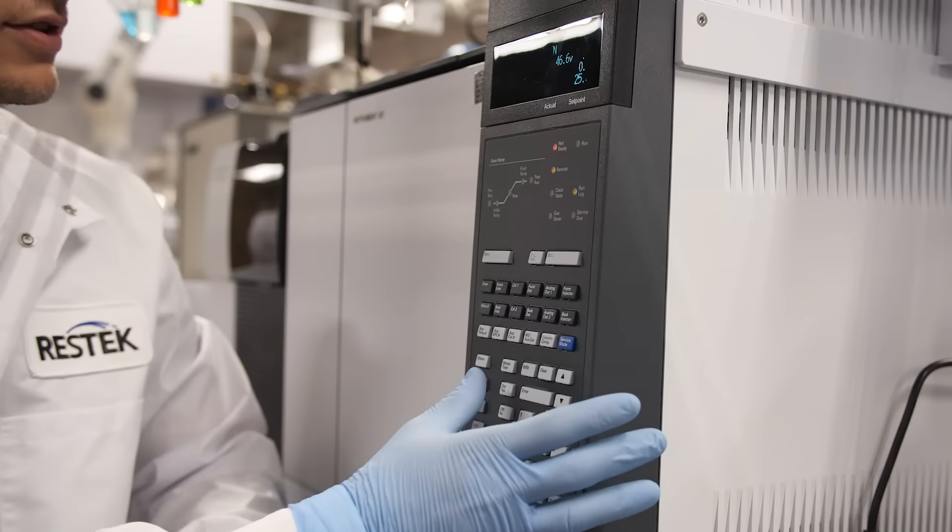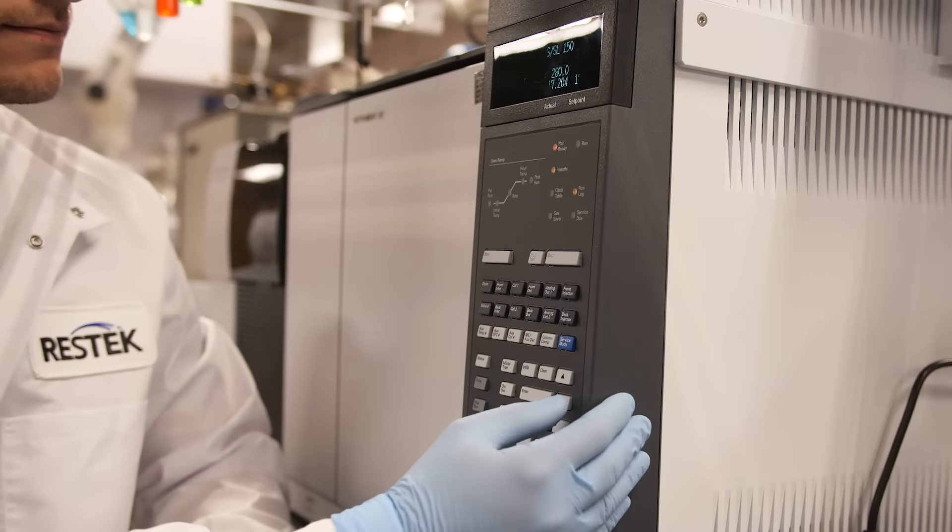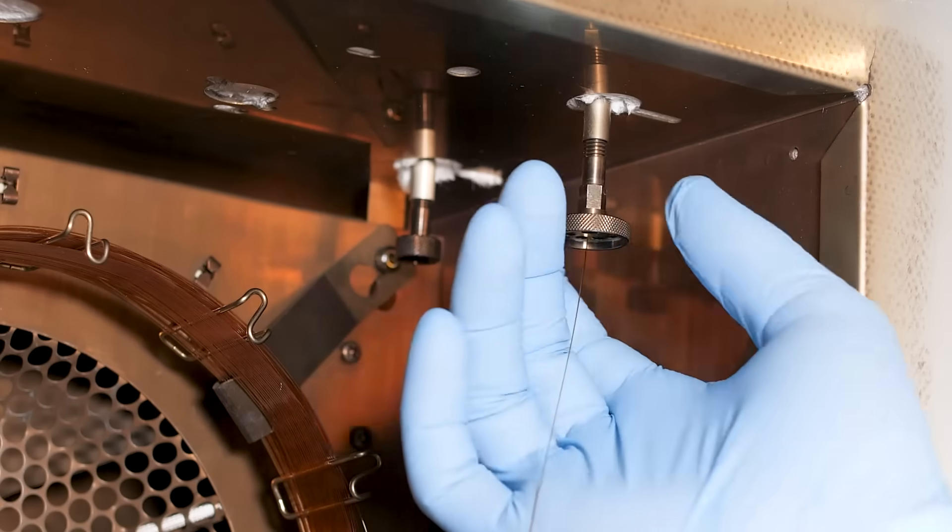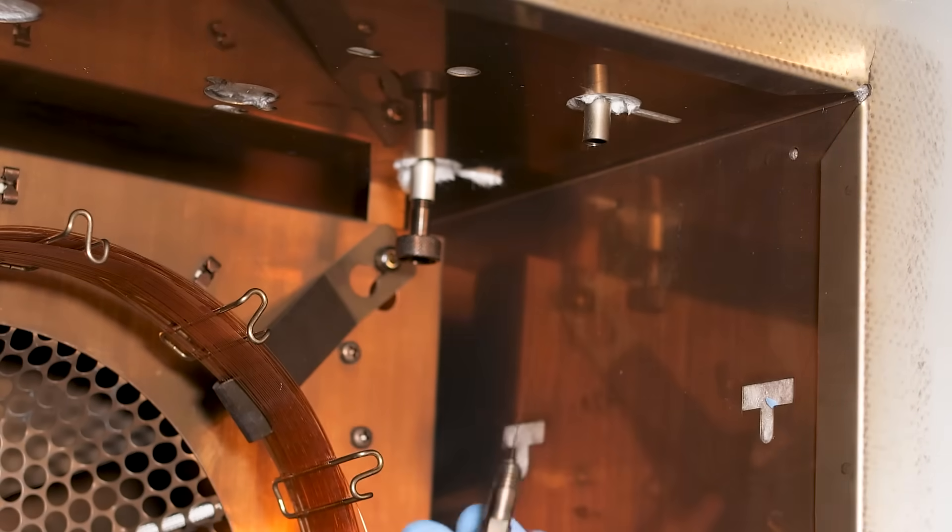To swap out these parts, first cool the GC, turn off the instrument flow, remove the column from the detector, and cool the FID. Be sure to also turn off all FID gas flows as well.